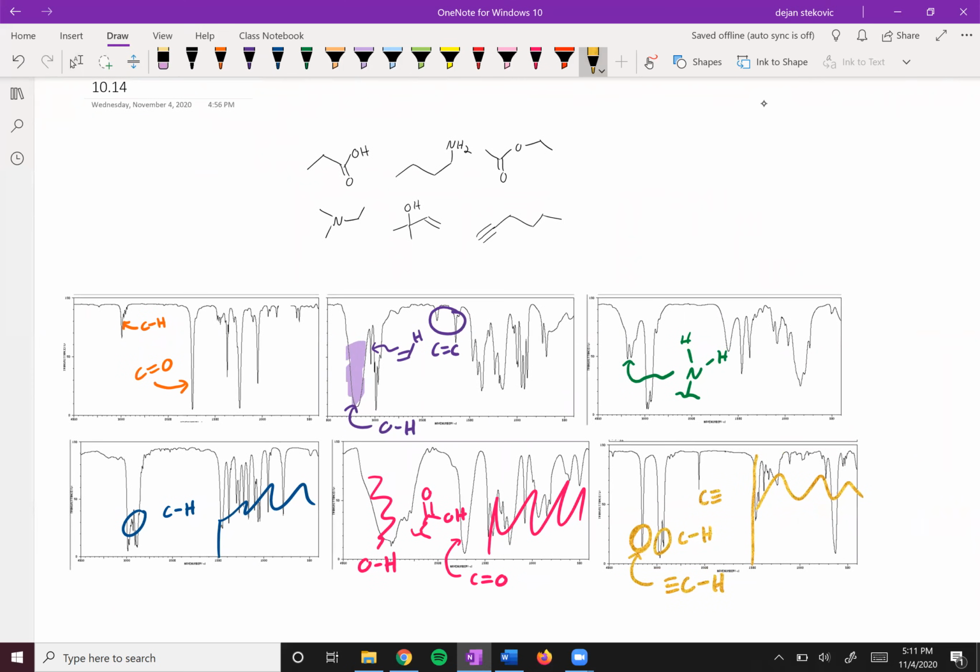And so you can start wherever, right? This is the only one that indicated a triple bond. And so let's take a look at our molecules. If we take a look at our molecules, there's only one of them with a triple bond. So that's got to match up with that one. Maybe another cool one you pick over here is this nitrogen with 2 hydrogens on it. Can we find something that just fits that detail? Yep, it's got that one right there. So we're good there.